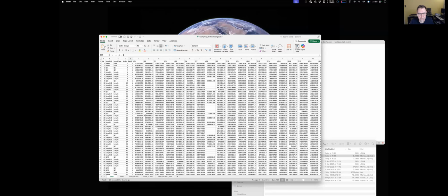As I was alluding to before, with modern methods that are far more linear than they probably were 10, 15 years ago, I'm saying every 10th sample seems to be a sweet spot for the frequency of QCs. But that also is dependent on having a batch sufficiently long for there to be around 10 or so QCs in a batch, because that's basically what you fit the curve to and cross-validate to. So really, it's the number of QCs in the batch that the algorithm is concerned about.